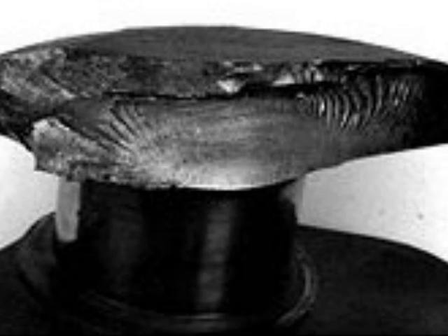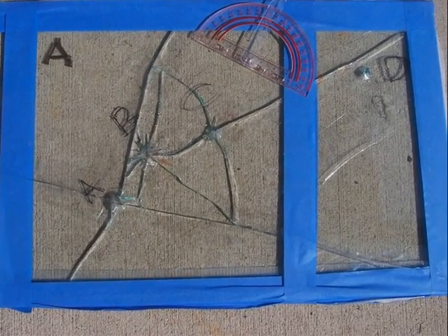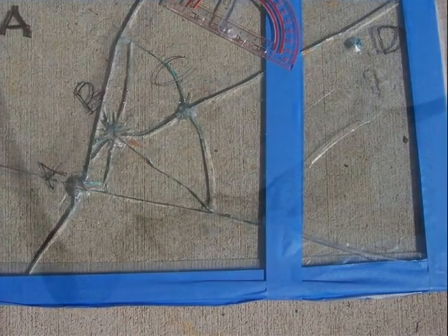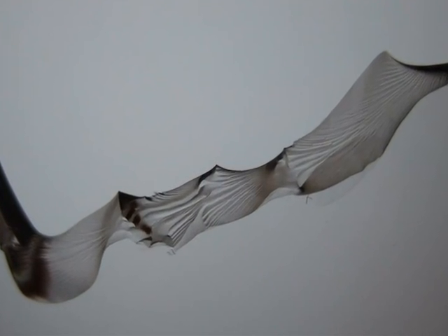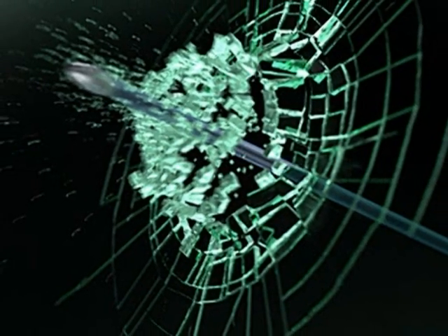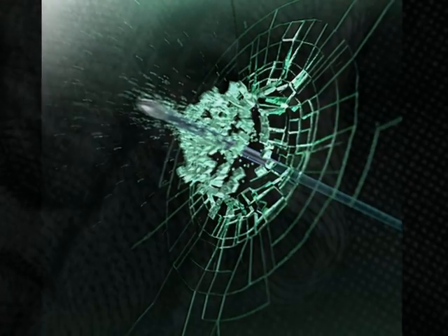In fractography, the stereomicroscope is applied in order to study the surface fracture details of a material. Under the stereomicroscope, fractures, striations and/or bends from a fracture of a material such as glass can be observed and used to indicate the location and direction a force of an object was applied to a sample. These findings can help to reconstruct the crime scene.